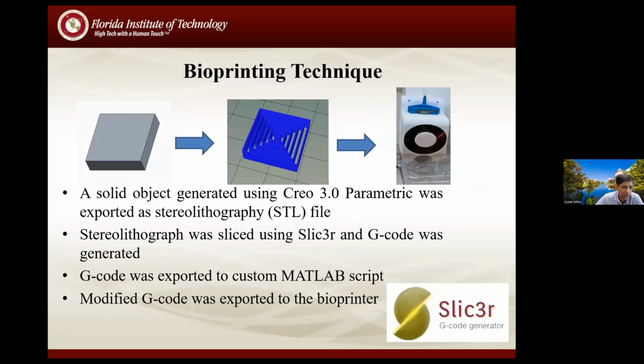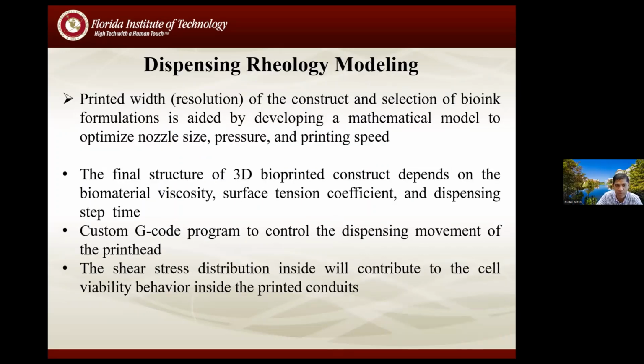So very typical, I'm sure you have seen that you use a lot of CAD models, use slicers, and then you can do a lot of customization, the G code, MATLAB. I mean, this is just the way we did it, but there are many, many programs. In fact, we are doing a little bit different way right now. This is maybe a 6 month old technique. We're actually using some new slicers which came with the printer. The printer actually added software that does a little bit better slicing.